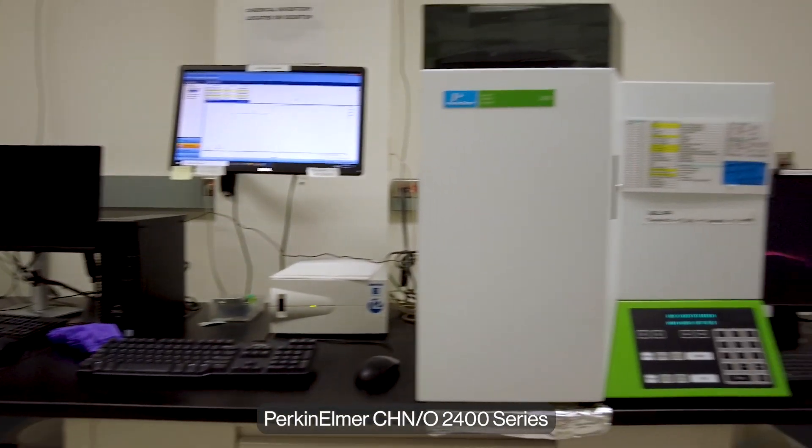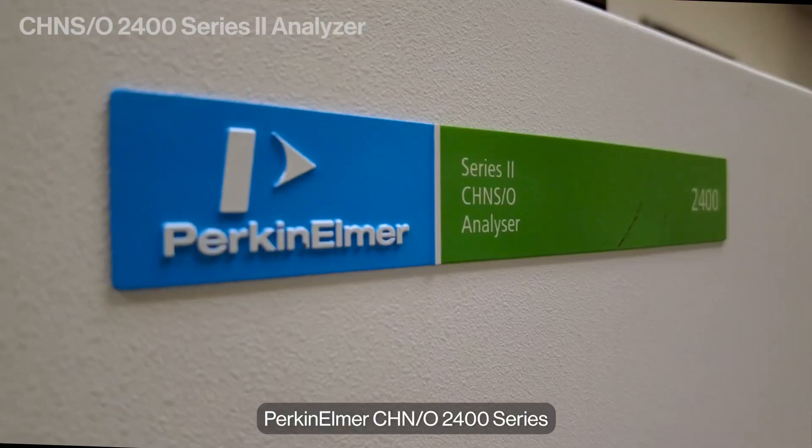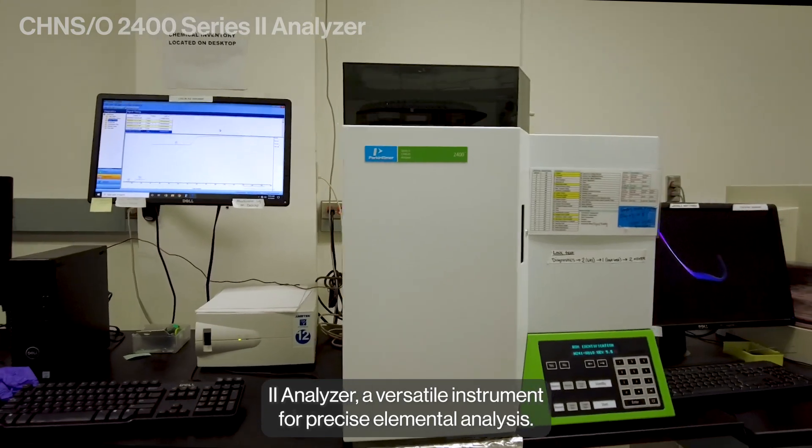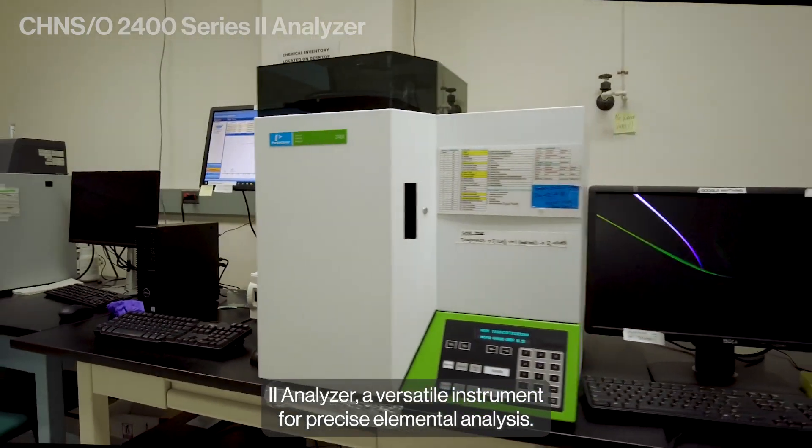This is our PerkinElmer CHNS-O 2400 Series 2 analyzer, a versatile instrument for precise elemental analysis.